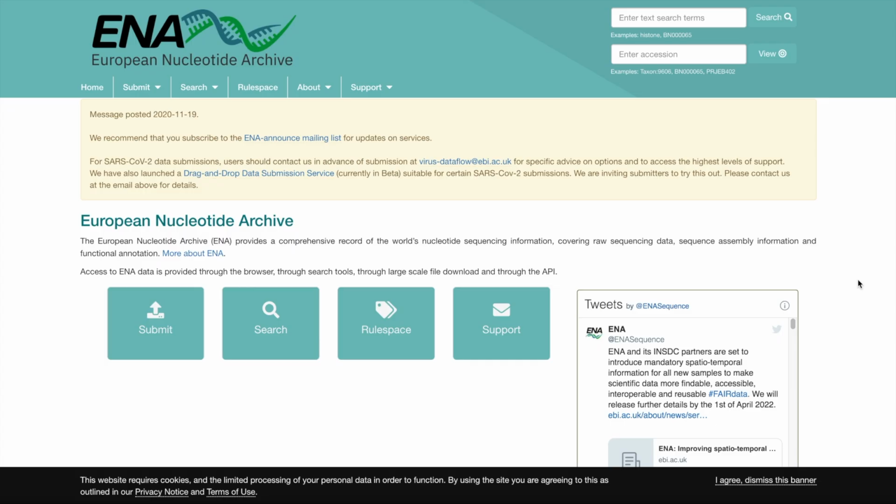Good day! Welcome to this video on how to find long-read transcriptomic sequencing data within the European Nucleotide Archive. This also serves as an introduction to the ENA's Advanced Search feature, unofficially of course.